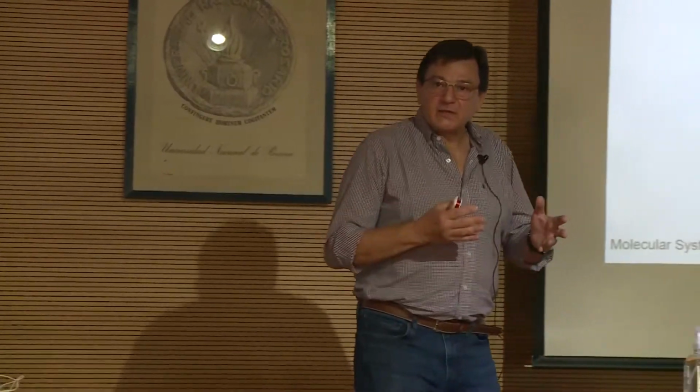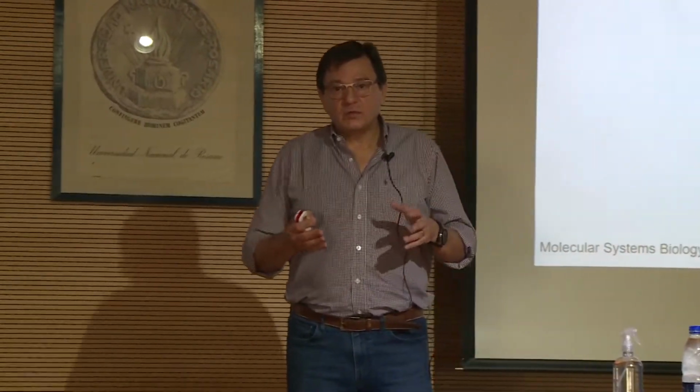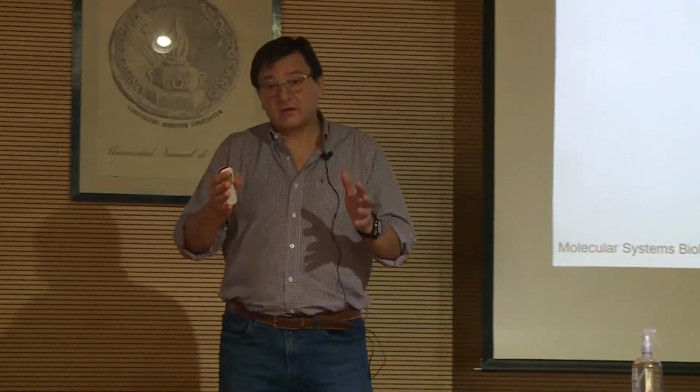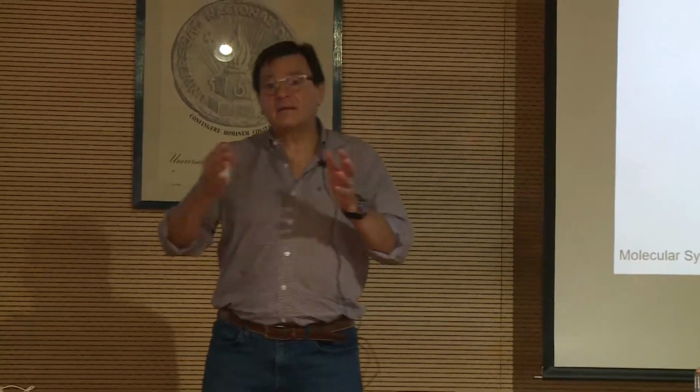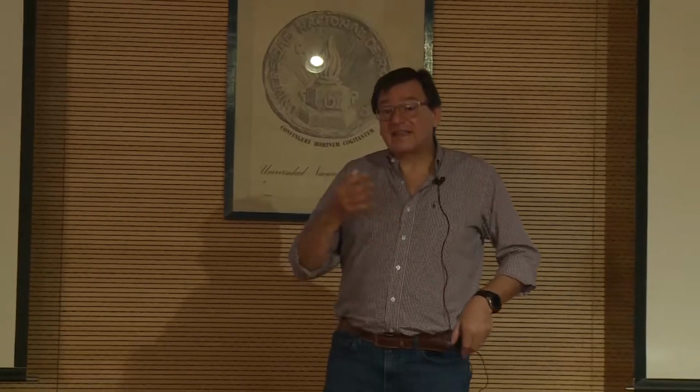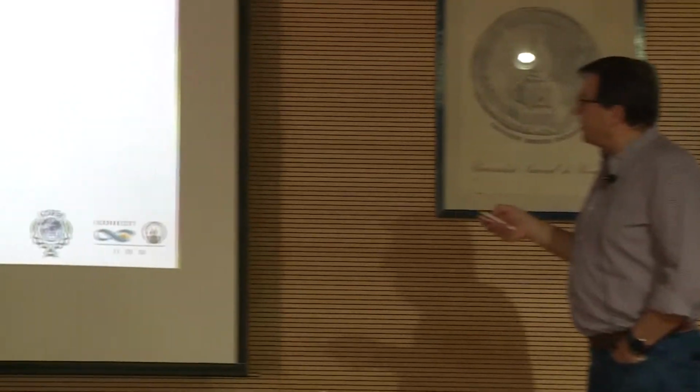So you can check the proteome in some kind of thermal condition, and then you check again the proteome that has changed for some external situation, for some growing conditions, and you check again the thermal proteome. And the method I'm not going to.